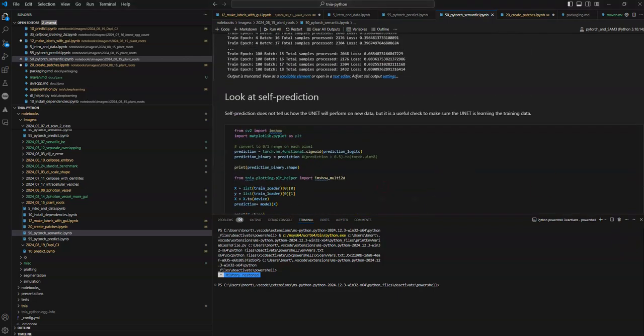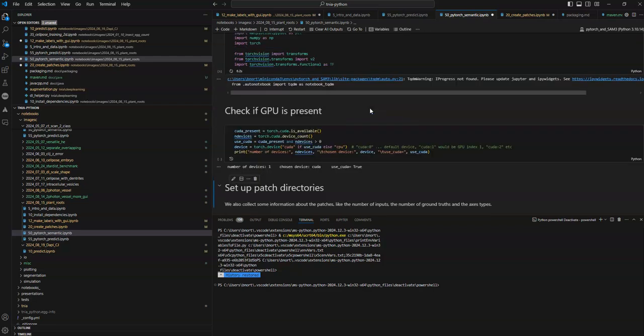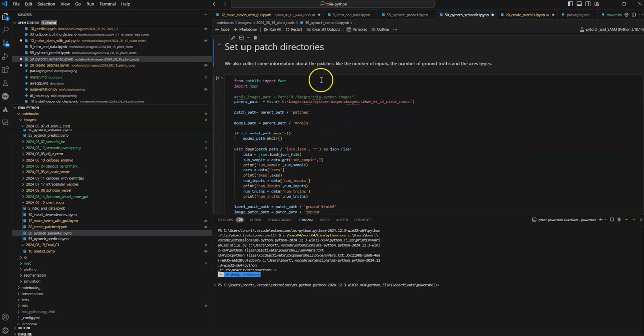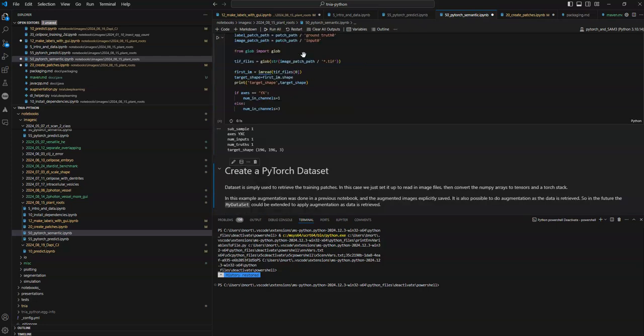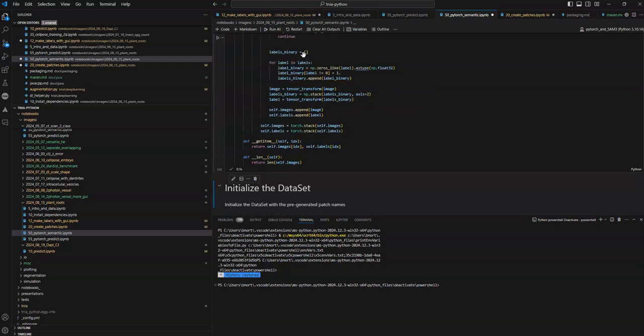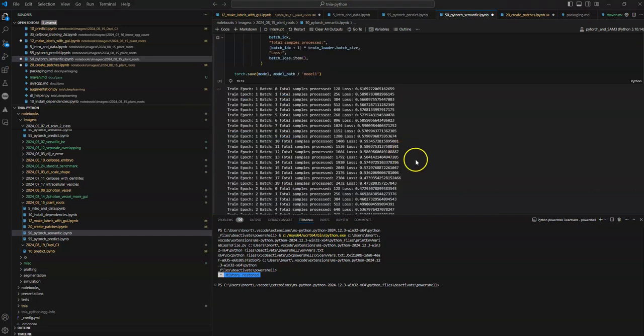So we've got this next network here. We'll actually use PyTorch, set up a PyTorch model, and I don't have time at all in this video to really do PyTorch justice. But again, this code is all on GitHub, so you can take a look at it. Basically we're going to set up a PyTorch neural network, and I'm going to pause while I do the training.